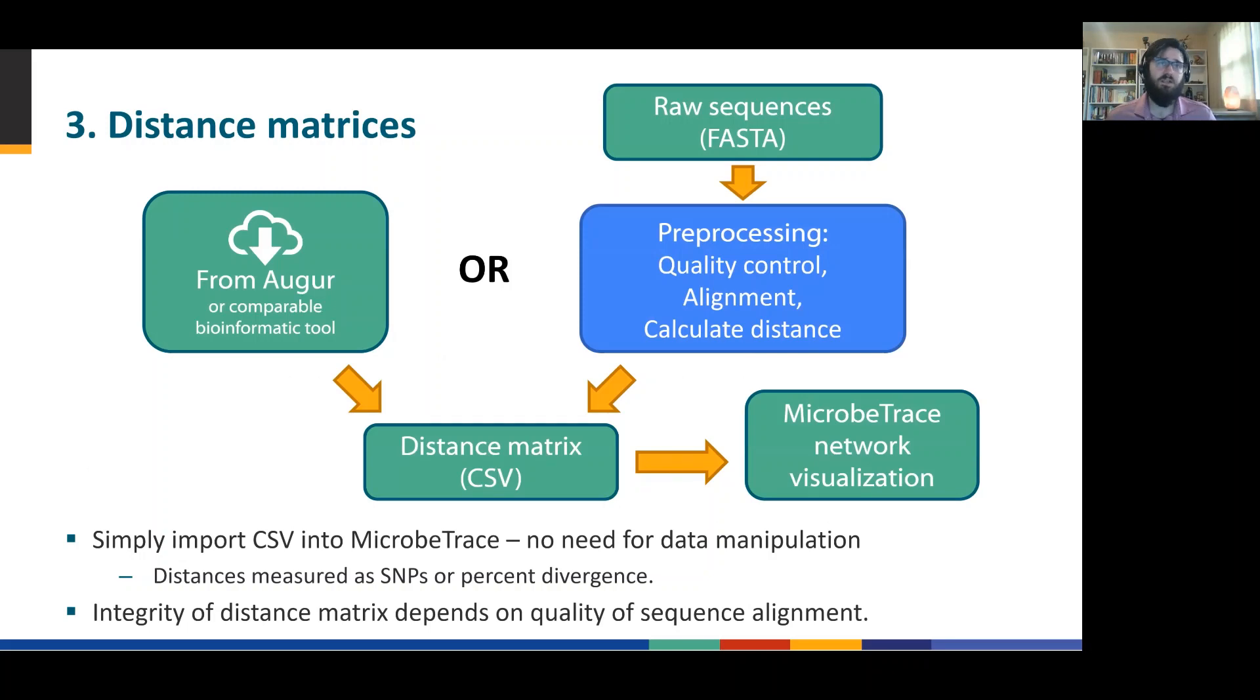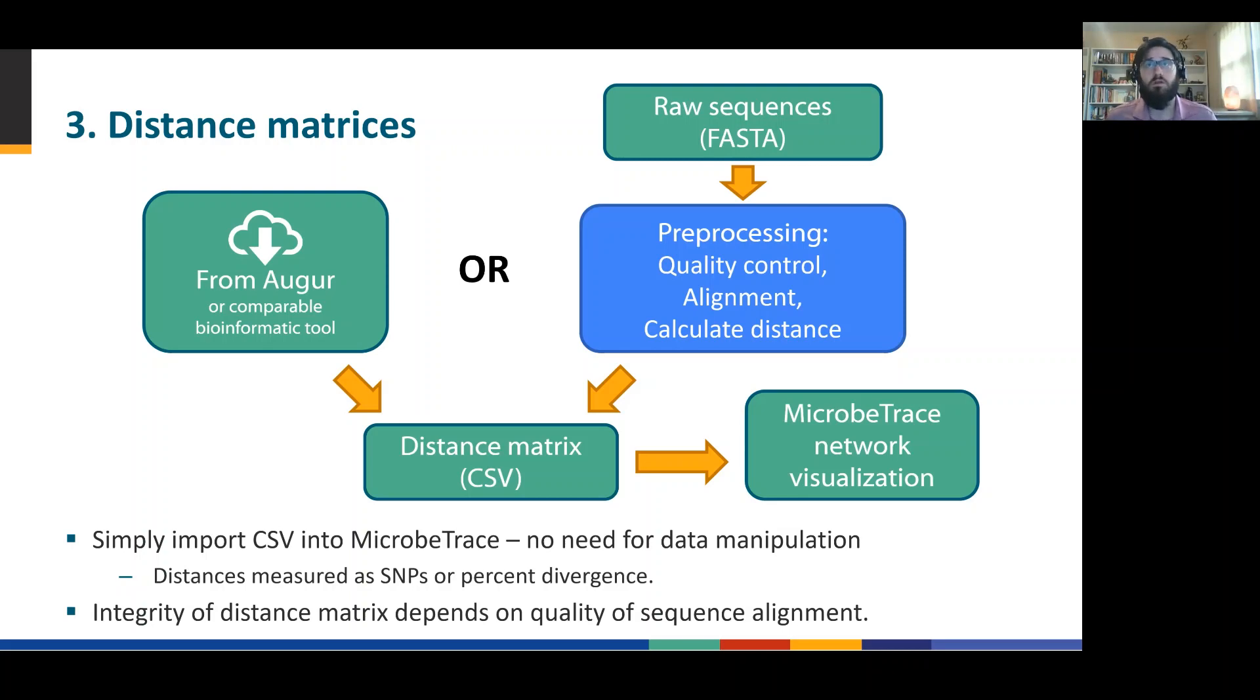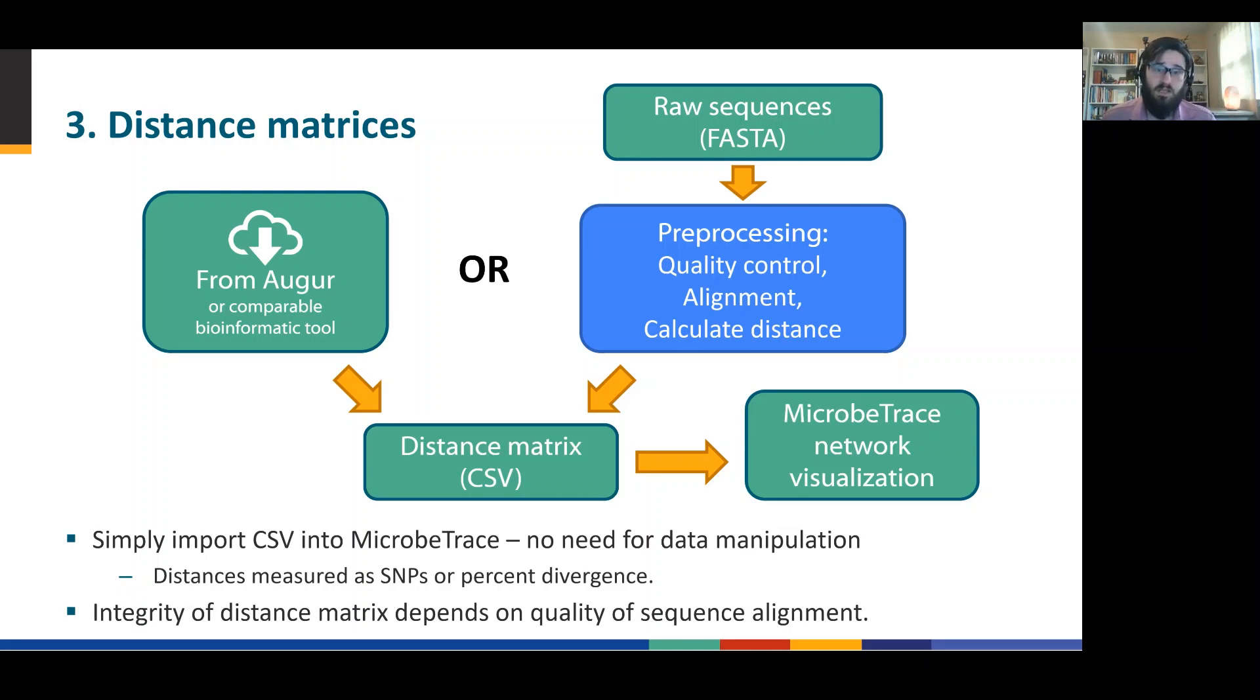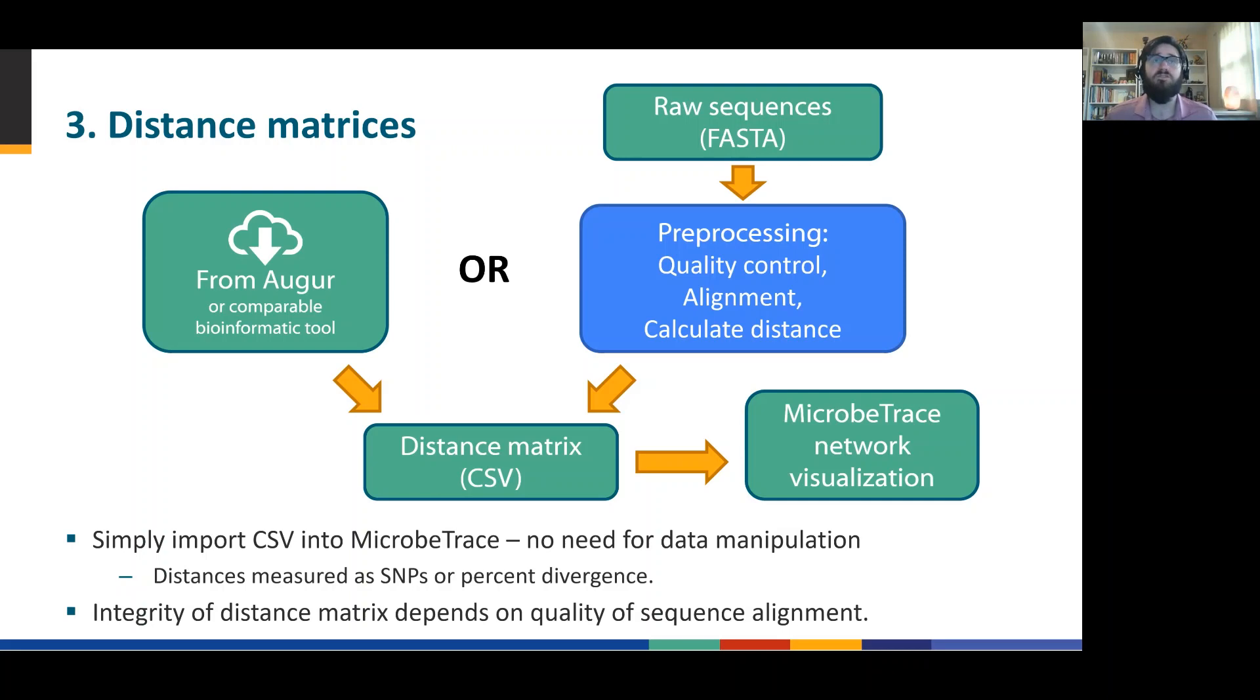And in much of the same way, we can render networks based on distance matrices. A common tool, the kind of guts of Nextstrain, is Augur. Augur can export a pairwise genetic distance matrix. You can of course generate your own from raw sequences if you follow pre-processing steps and then calculate those distances according to whatever algorithm that is most valuable. But ultimately we need to arrive at a distance matrix format that can then be imported into MicrobeTrace. And this can be both as SNPs, single nucleotide differences, or it can be in terms of percent divergence, so how distant two things are. The key is that an increasing number leads to increased distance.